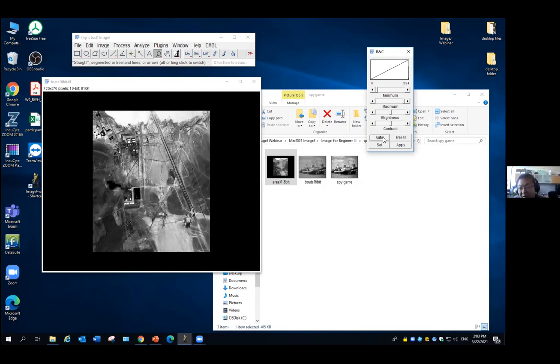Just in case, sometimes we go through ImageJ, always doing it on your scientific images. Sometimes you want to make it a little bit fun, make it useful, or you can keep it as a kind of secret communication way with your significant others, or in the future, maybe you do want to be a spy. It can be helpful. Okay? But don't do it like this because everyone knows how this is done. You need to figure out something more complicated, but the basic principle is like this.